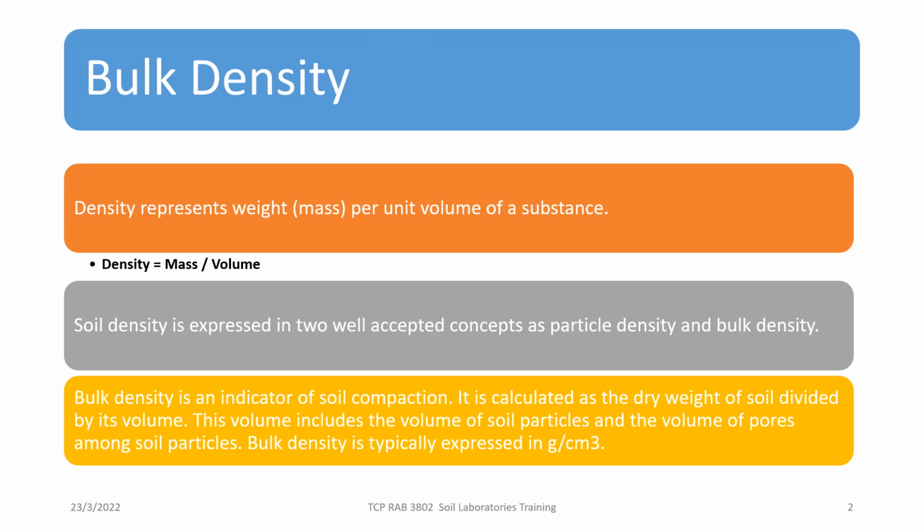In general, for bulk density we are concerned with determining the weight of the soil and then determining its volume. After determining weight and volume, it is very easy to calculate the bulk density of the soil.